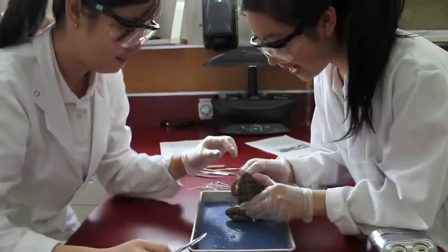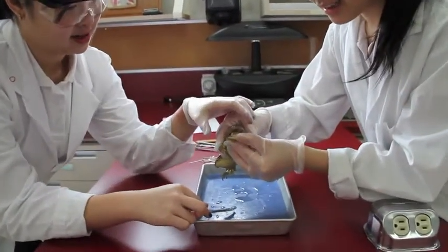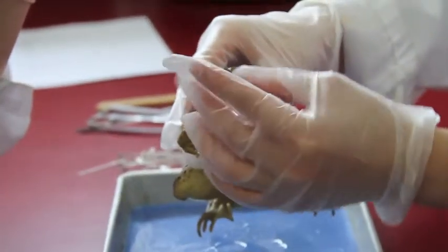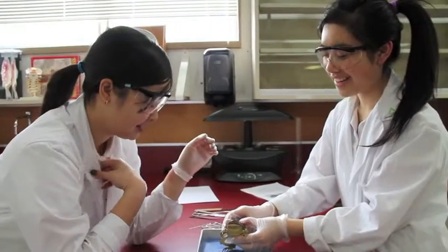Just to look at the mouth and the tongue, can you take a look? What am I looking for? His tongue — the tongue attached to the lower jaw. The esophagus. Oh, to look at it, it's anatomy.